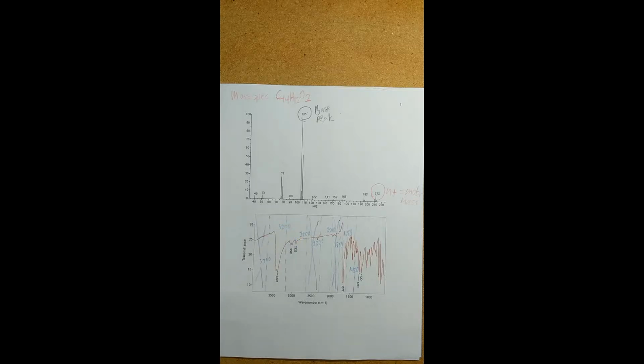I went ahead and did the math referencing the compound chem worksheets and was not able to find any hint or any structure to come up with those differences. So in this instance, they were more or less useless, but in some, they can be extremely helpful.